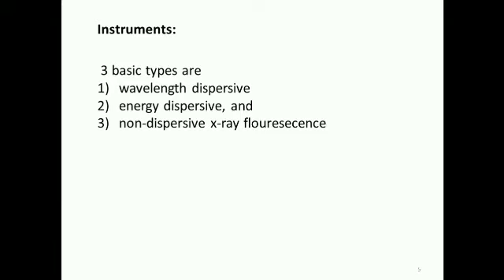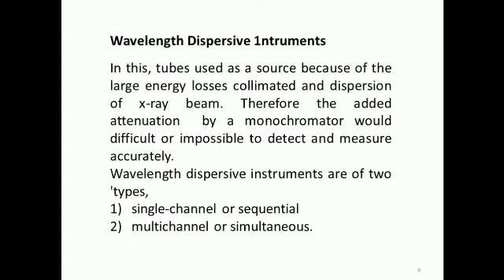Next, instruments. There are three basic types of instrument: wavelength dispersive X-ray fluorescence spectrometer, energy dispersive, and non-dispersive X-ray fluorescence. Wavelength dispersive instrument.